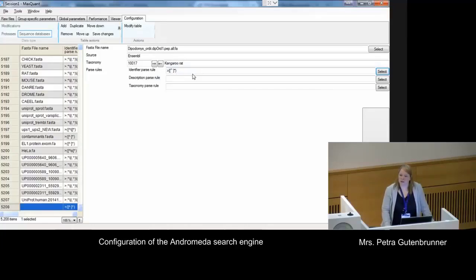Yes? How would you know that's the correct one? Like UniProt's obvious. Yeah, we come to the point. I will show you later.